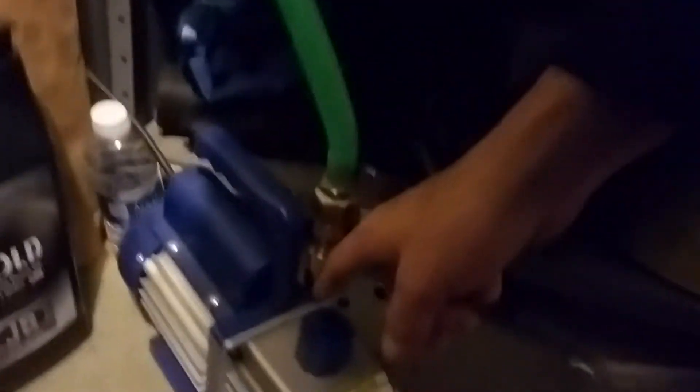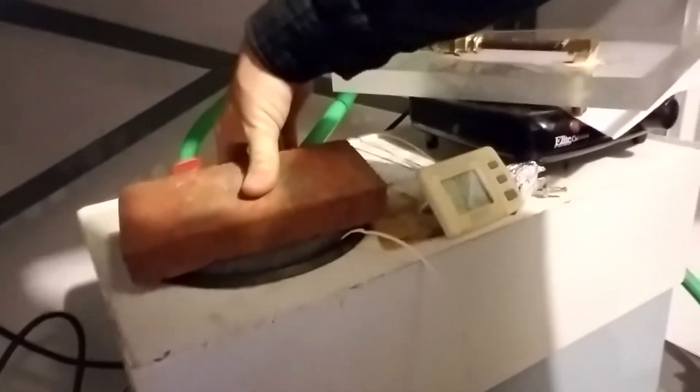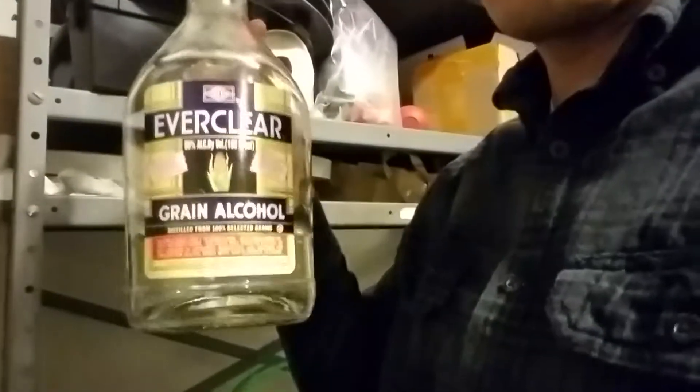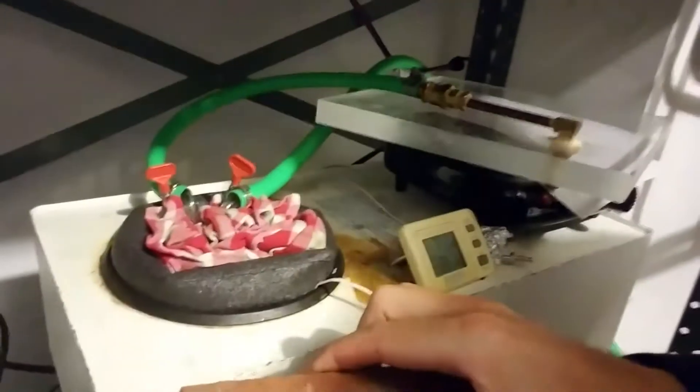The cold trap basically cools this glass jar down to about minus 60°C — it's only about minus 25 now, but it'll get there soon. The vacuum pump pulls vacuum through this hose, through the cold trap glass, and then sucks it out of where we put the pressure cooker. We need this so moisture doesn't get into and clog the vacuum pump. The cold trap liquid needs to stay liquid at minus 60 degrees, and the best liquid for that is almost pure ethanol — you can buy it laboratory grade, or just use Everclear from your local liquor store.